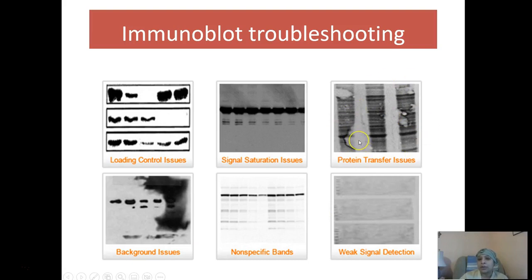Protein transfer issues, again, would be when your gel and membranes were put together in the transfer. If you don't take away all the bubbles, roll out all the bubbles, make sure that contact is complete, you're going to get these transfer issues with the bubbles, and that will obviously lead to issues with detection. Also, sometimes you have just too much protein of the one that you are interested in, and you have signal saturation issues.